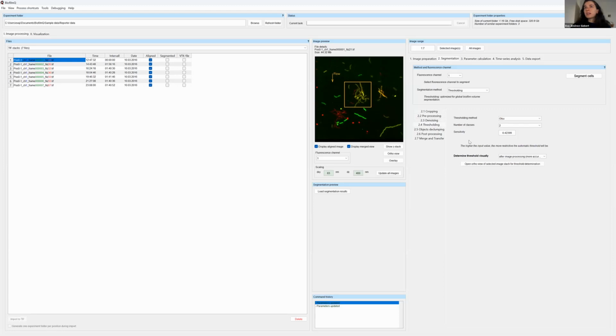And you can actually get visual feedback on what you're doing with these filters on the next tab, the thresholding tab. Here you can select different methods of thresholding your images. You can select some of the automatic methods where the threshold is detected automatically and then your data gets put into background and foreground automatically. Or you can select the manual threshold, in which you just select some threshold and that's the one that is used. This is an intensity value, so every intensity above this value is detected as a cell, and everything below this intensity value is background.